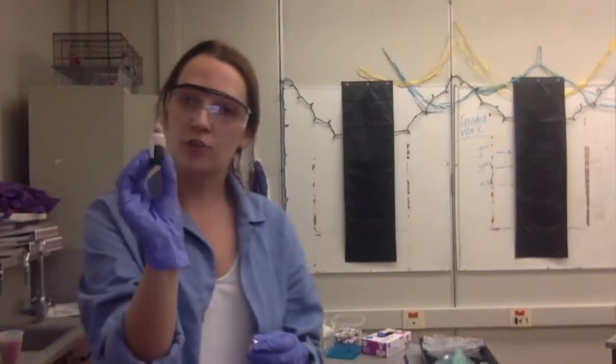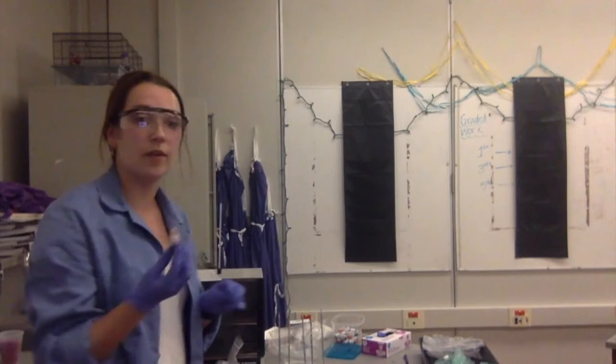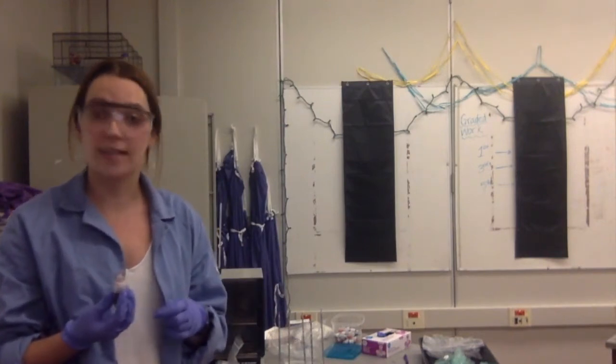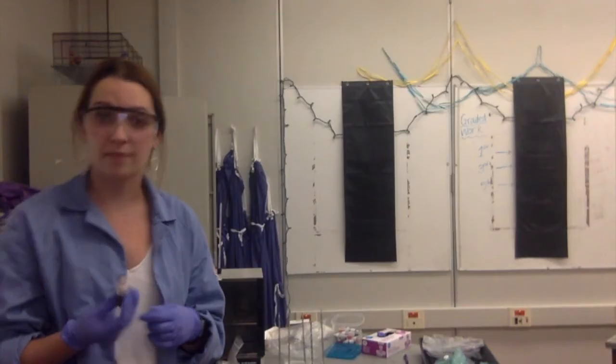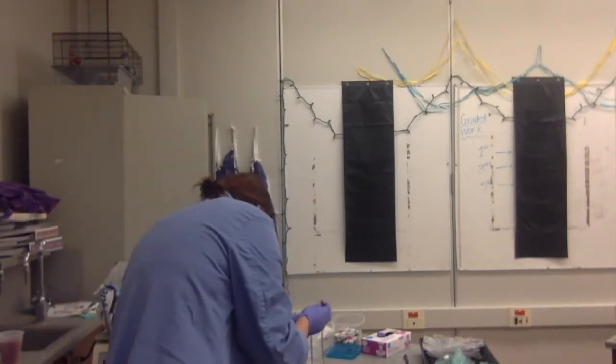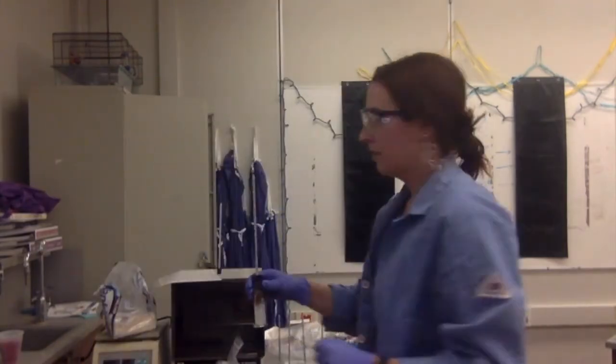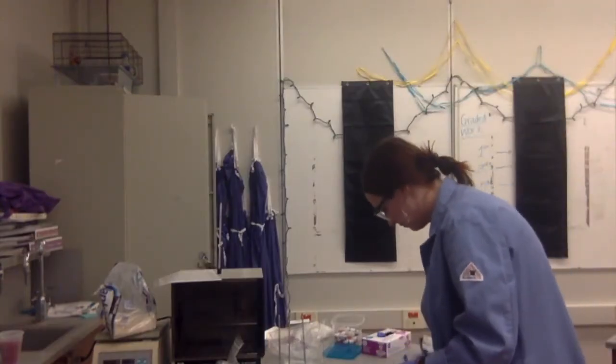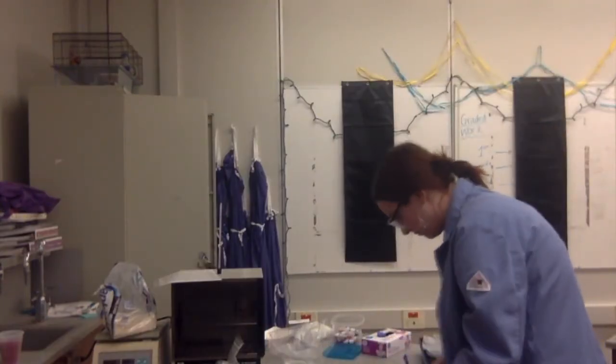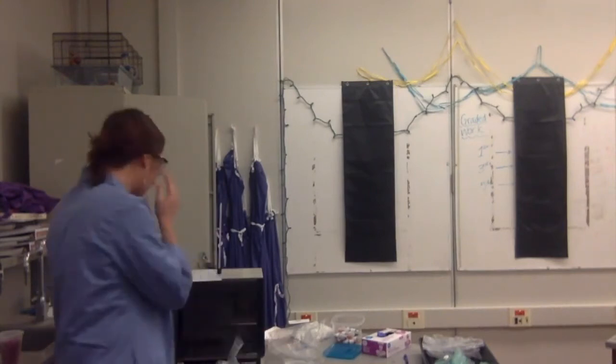I'll be adding a small drop of red food coloring to the top of each respirometer to help us take volume readings as they move in the water bath. Here's the finalized respirometer with the food dye at top. We're going to put these into the water baths and measure the rate of respiration over time, taking readings at four-minute intervals.